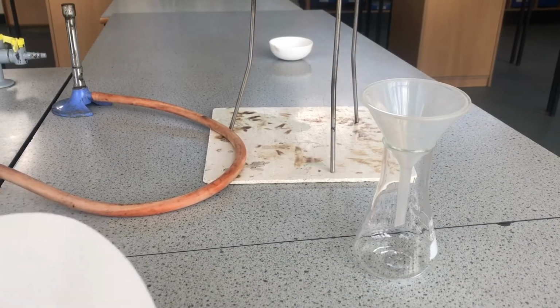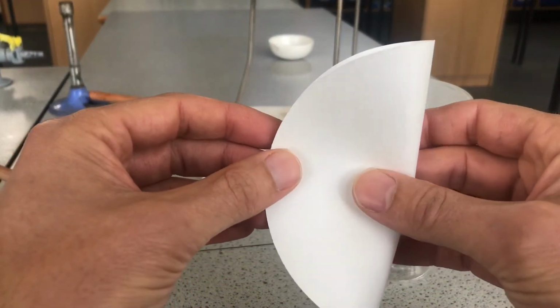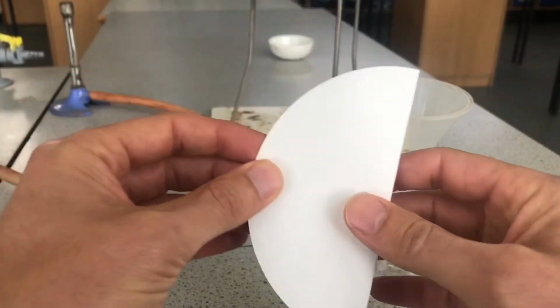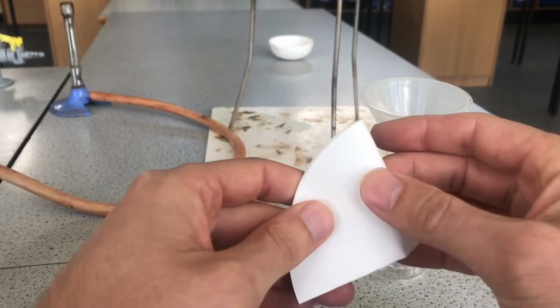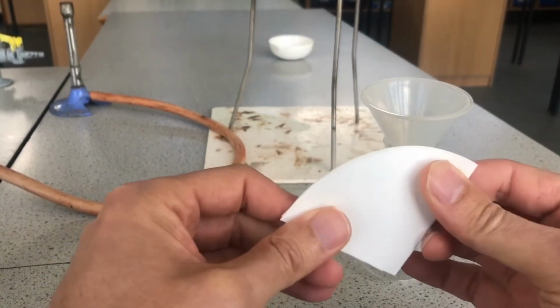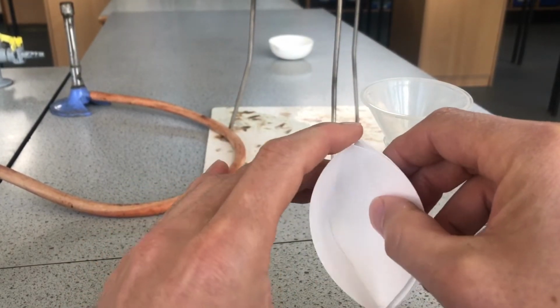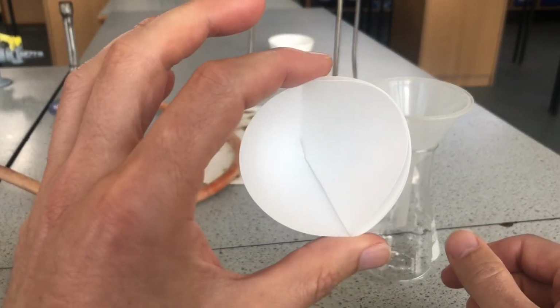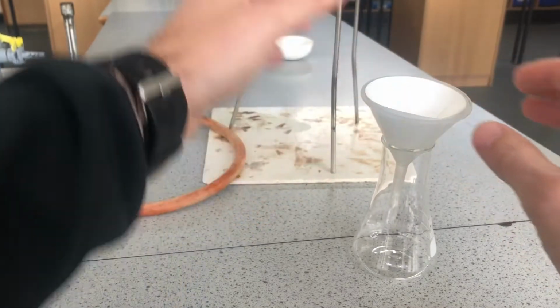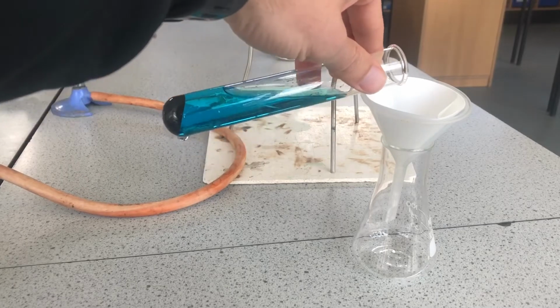Now we've finished heating the solution, to ensure all the sulfuric acid reacts with the copper oxide, it's time to filter to remove that excess, unreacted copper oxide. We're going to filter it using a filter paper, and I'm just folding that filter paper now, and that's the traditional way to fold it. Fold it in half and into four, and open one quarter of it like that, so when we look down, we see nothing but paper. We'll put that in a filter funnel, and we will take our solution and start filtering it.